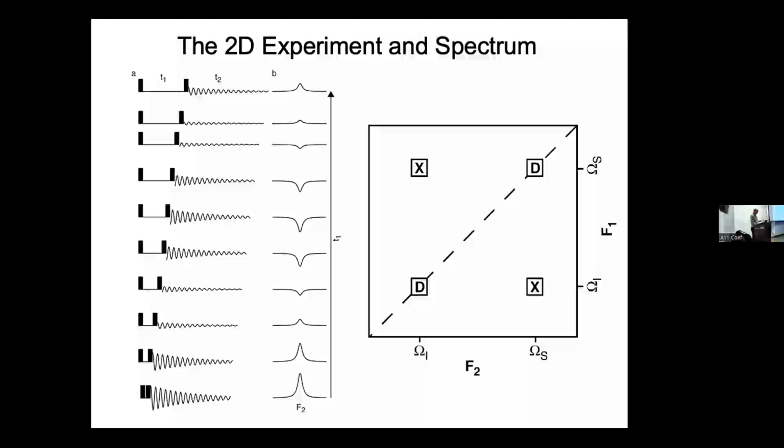And what we will do for the purpose of much of the course is say, we just stack these up in another dimension, pick columns and do a Fourier transform column by column, and end up then with a two-dimensional spectrum in which the peaks that came from operators that had the same frequency in T1 that they had in T2 will lie on a diagonal, and operators that had different frequencies in T1 versus T2 will be off the diagonal somewhere.